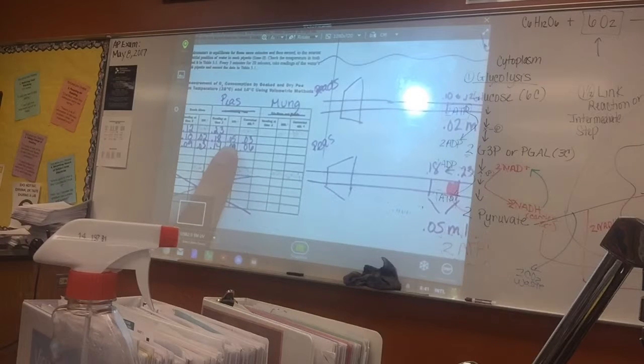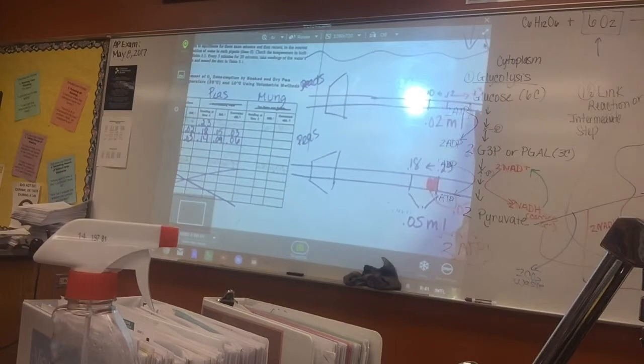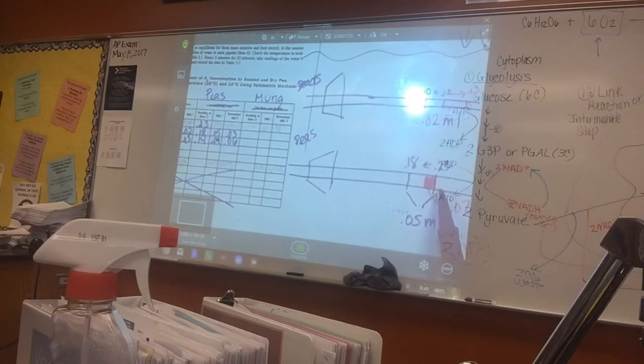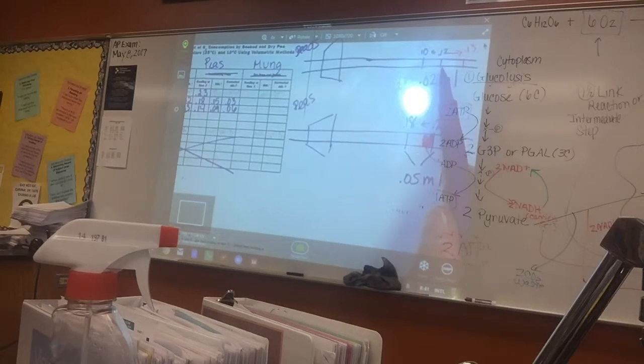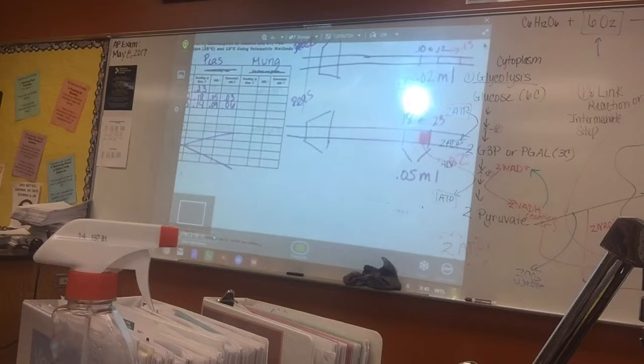For the difference, you just record the actual value. You add it because the beads went out instead of changing or staying the same. Really, the peas took in an extra amount, because the beads went out instead of going in. It should have gone in, by that amount.